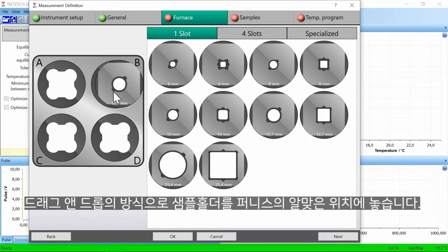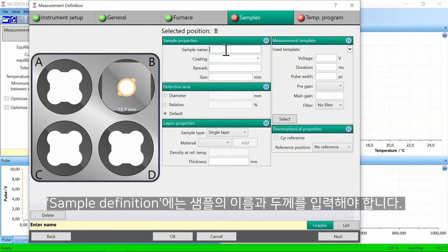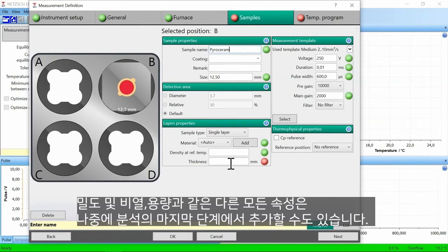By means of drag and drop, the sample holder can be selected for the appropriate furnace position. In the sample definition, the name and the thickness of the sample must be entered. All other properties like density and specific heat capacity can also be added later in the analysis.